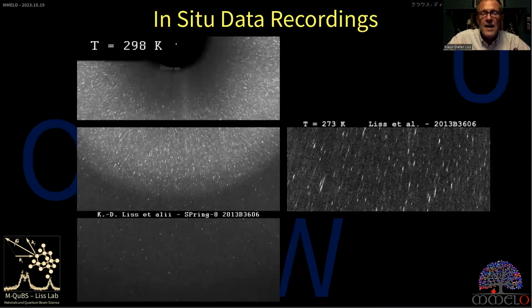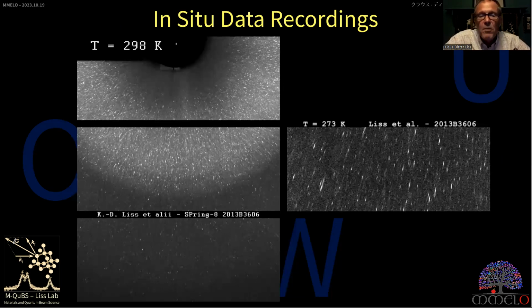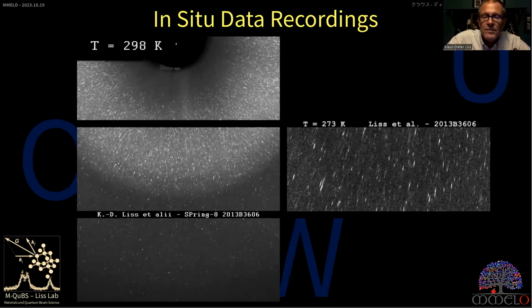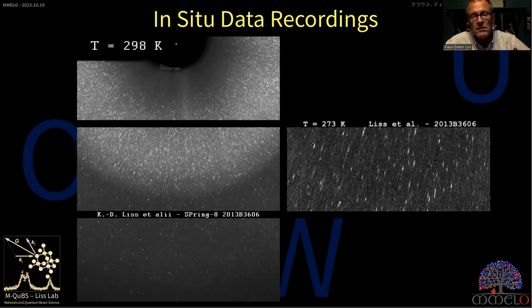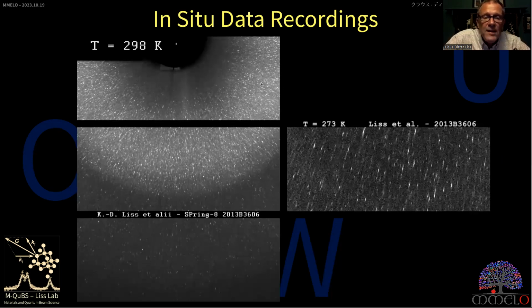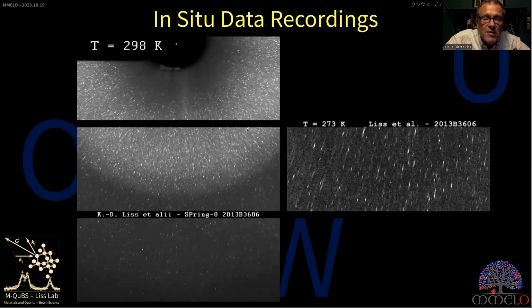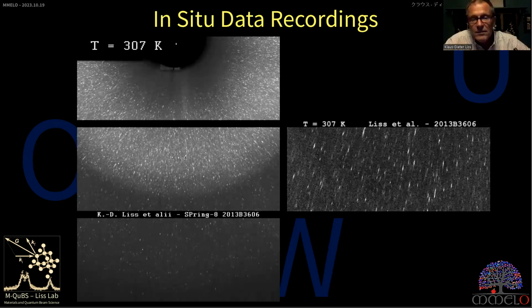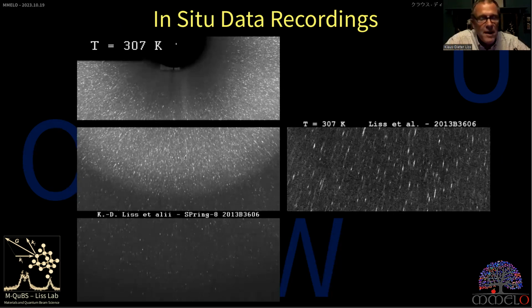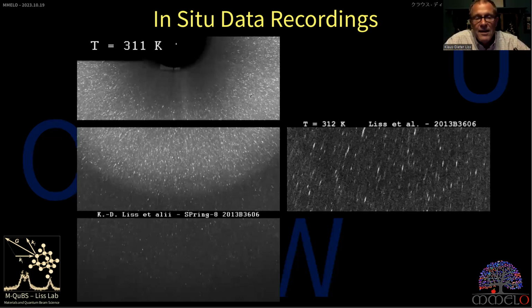These are movies now, heating up the material from room temperature to high temperature. We see already there is a halo. This is magnesium AZ91. So there's a halo of many reflections from polycrystalline material. This is not ultrafine. This is maybe 10 micrometer grain size.